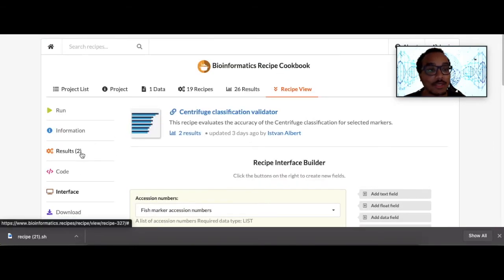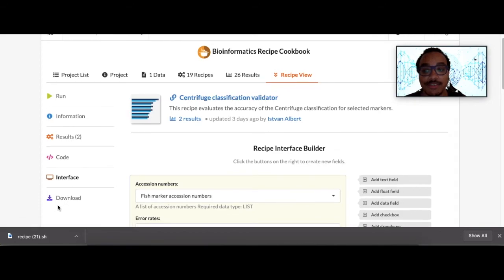If we want to run this recipe locally, we can of course download it by pressing this button. And once we've downloaded it, you can run this recipe given that your local machine also has the same required packages installed, and you set the parameters correctly, everything is set to run. This is made so that the recipes platform is decoupled from the actual data analysis part, so you don't need an interface to run the data analysis.